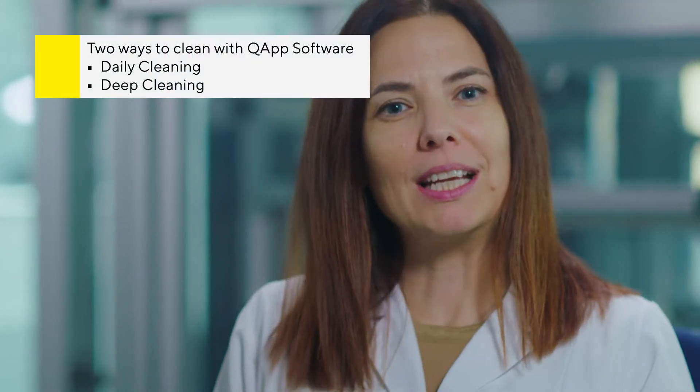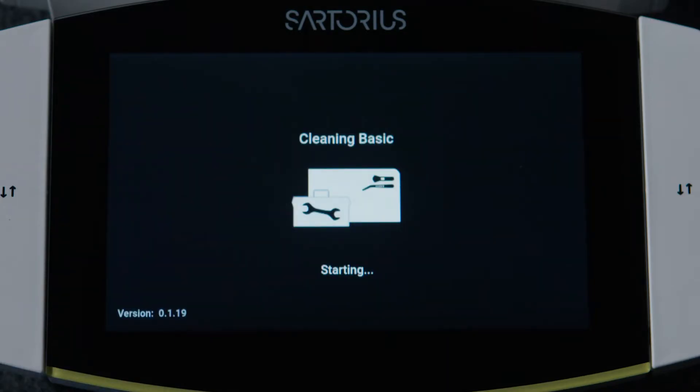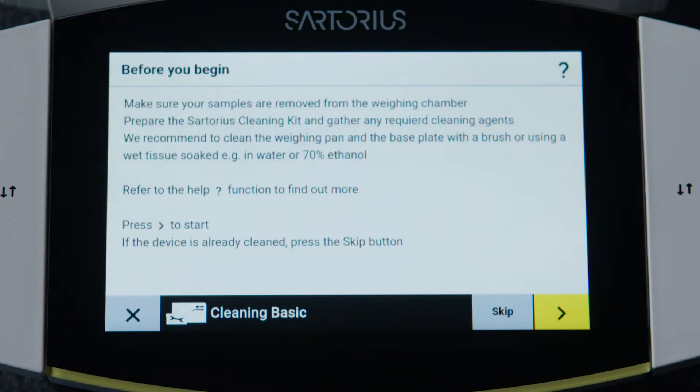There are two types of cleaning: the daily cleaning and the deep cleaning. For the daily cleaning, just activate the basic cleaning app and follow the two steps. That's it.